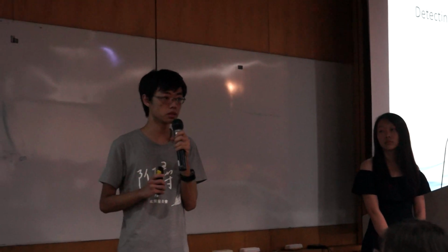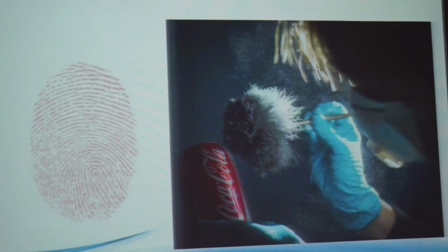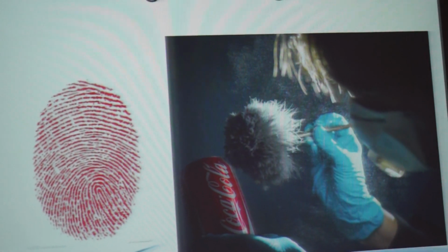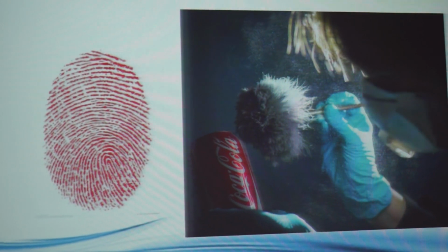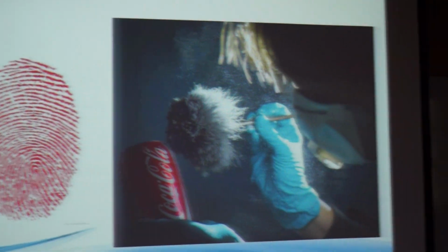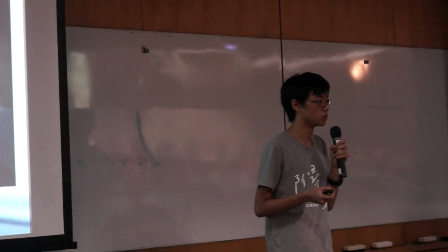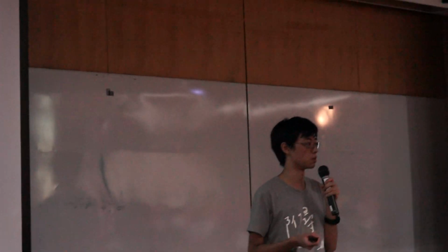A latent finger mark is a kind of finger mark that you cannot see at first, but after some particular steps, the finger mark will appear. Those steps are what we call detecting the latent finger mark. The most common way to detect the finger mark is using carbon powder or silver powder to detect the moisture in the finger mark.